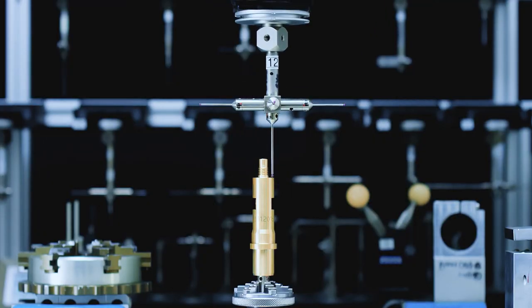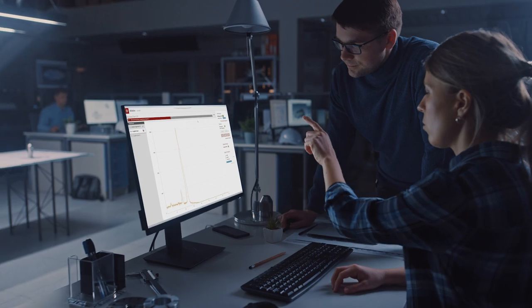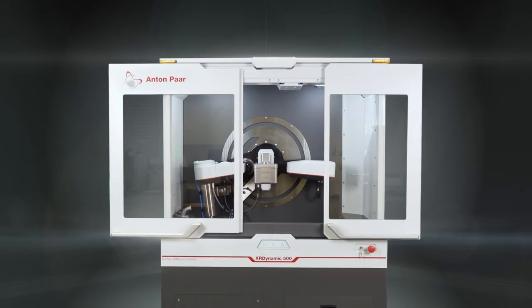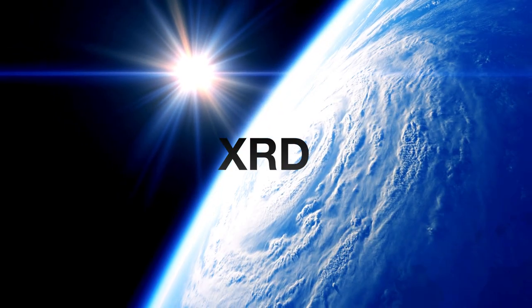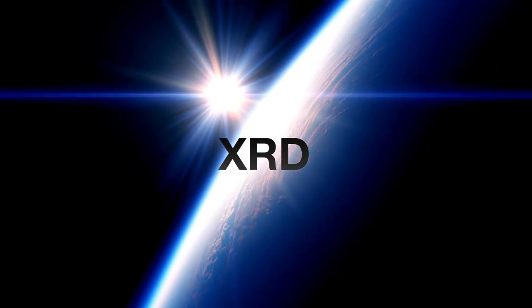XR Dynamic 500, driving XRD. When something is in your DNA, you can just feel it.